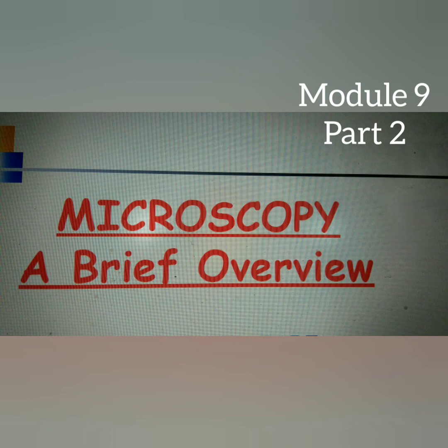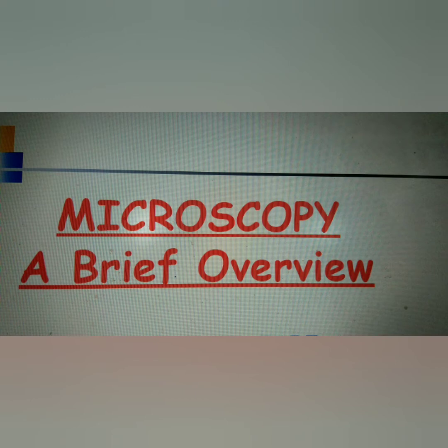Hello students, this is the lecture based on the chapter microbiology, and this is a part of the microbiology chapter which is called microscopy. If you divide the chapter in three parts, then you can take it as the second part of the chapter. It is no accident that the development of microscopy and microbiology have often been closely interlinked. Microbiology begins where the naked eye reaches its limit.